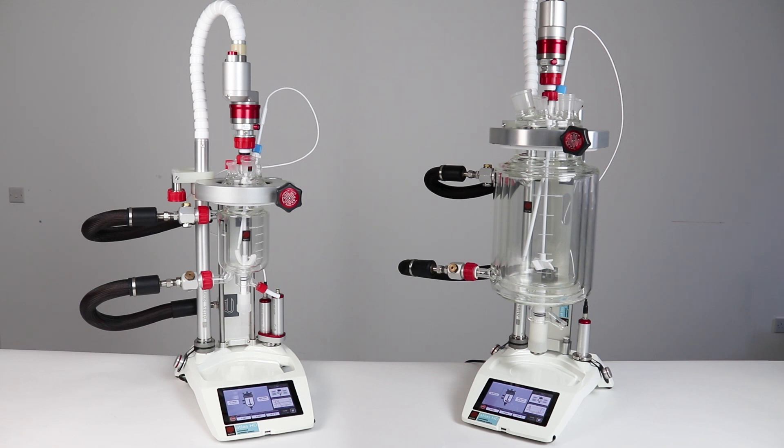The new DN150 vessel clamp can be used with vessels starting at 1 litre and offers vastly improved access to the vessel contents.